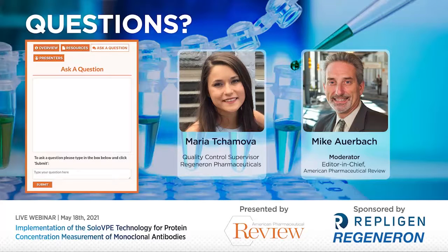Maria, our first question is, understanding that this presentation is limited to mAbs, have you at Regeneron tested other protein modalities on SoloVPE with varying extinction coefficients? Thanks, Mike, for the question. At Regeneron specifically, we currently focus only on monoclonal antibodies. However, there are documents out there of other modalities being tested using this technology, and I'm sure Repligen would be able to provide more information.